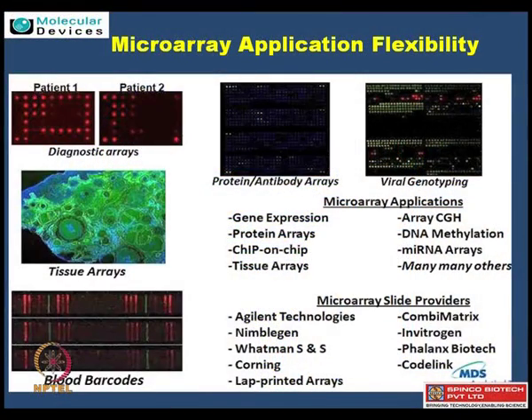Now, can you just brief some of the applications of the microarrays which people usually perform by using these type of scanners and the software? Yes. So classically, microarrays are being used for differential gene expression, which people categorize in the gene expression format. Later, as development happened, people went for SNP arrays as well as CGH, called comparative genome hybridizations. Right. They are used to look at the chromosomes. Apart from that, protein arrays and chip-on-chip to look for the control genes are also being focused on.